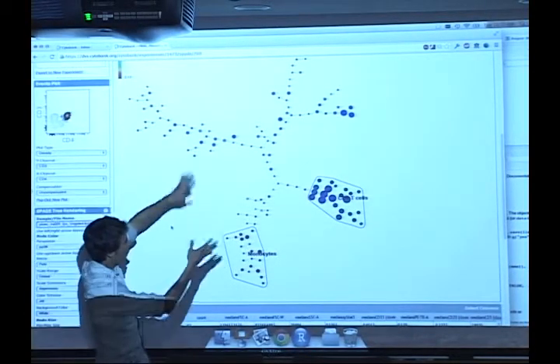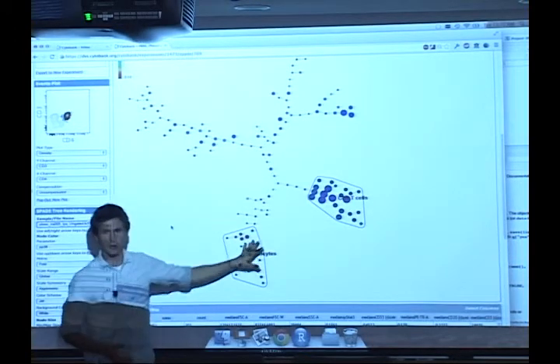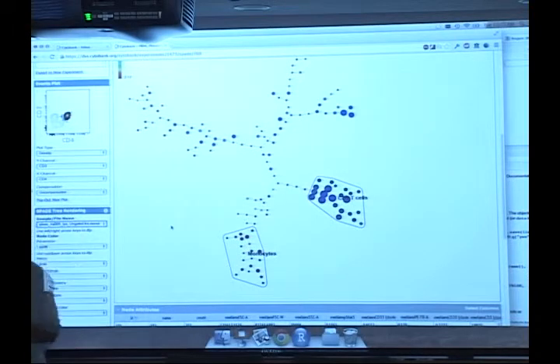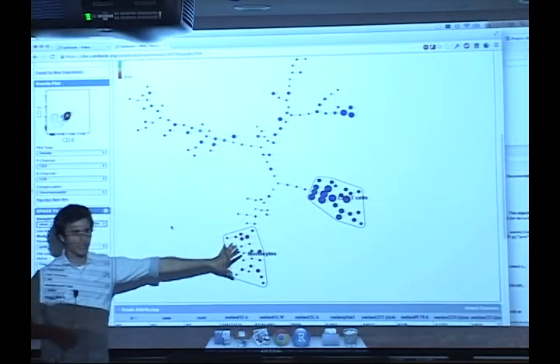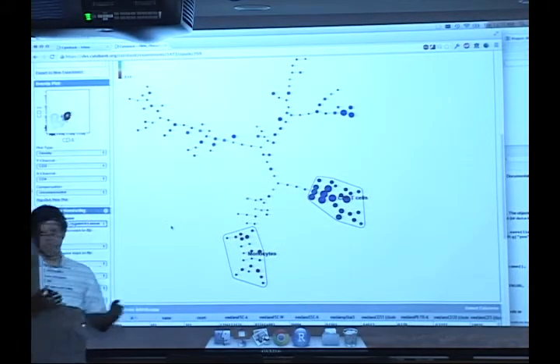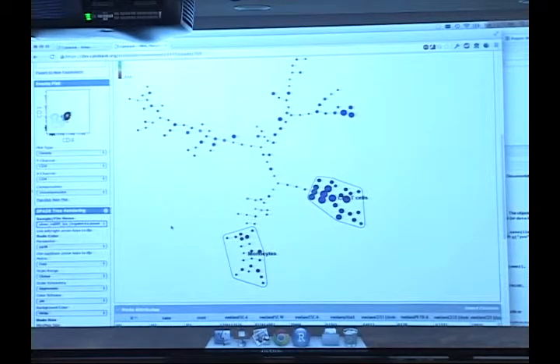When we color by that, we can see that the monocytes really light up. So there's a functional response in this branch of cells, telling us that these guys are changing significantly in response to our stimulation versus our unstimulated baseline. This is the same kind of visualization that you would see using a heat map, but this just shows it in nice SPADE tree form.